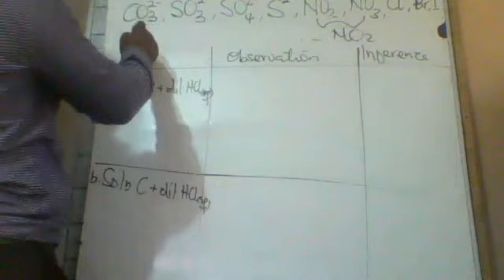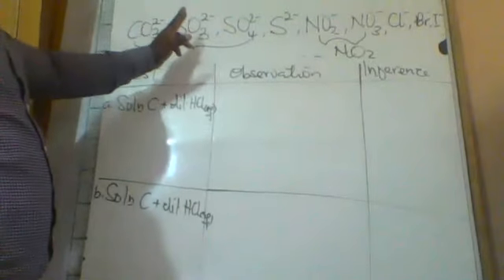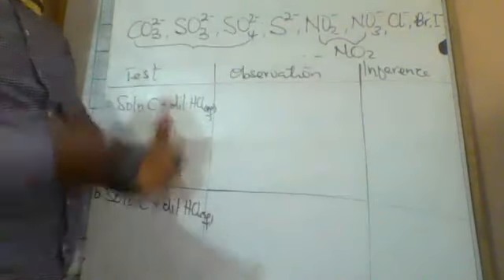Now, when it comes to the specific test, the carbonate, the sulfite, and the sulfate go together.